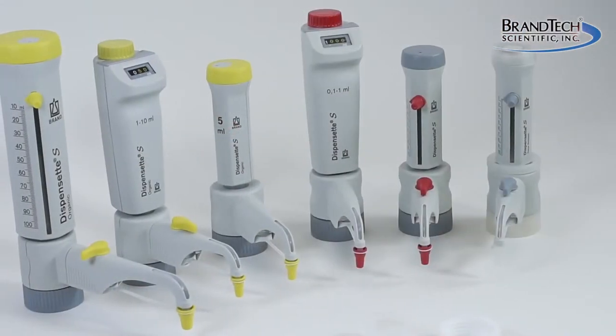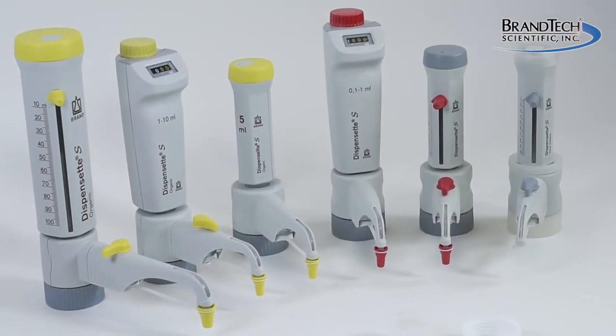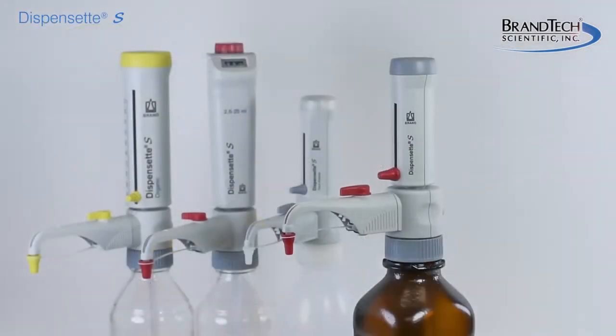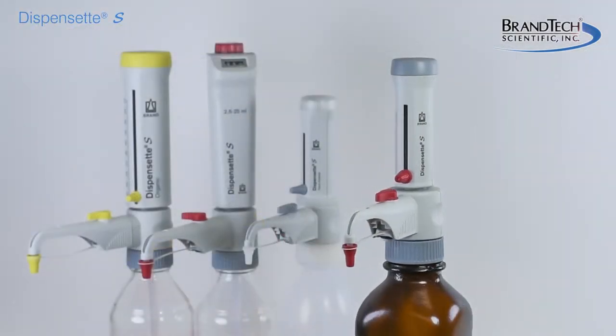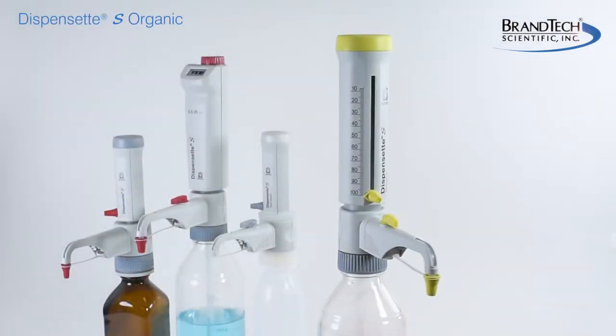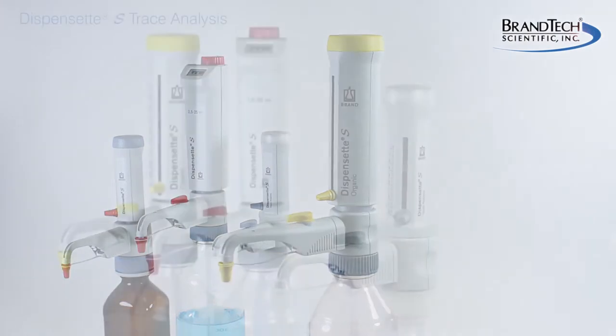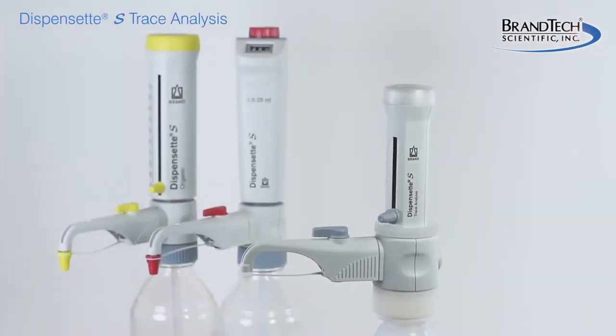The Dispenset S comes in several different models to dispense virtually any laboratory liquid: the standard Dispenset S for general purpose dispensing, the Dispenset S Organic for concentrated acids and difficult organic solvents, and the Dispenset S Trace Analysis for high purity reagents.